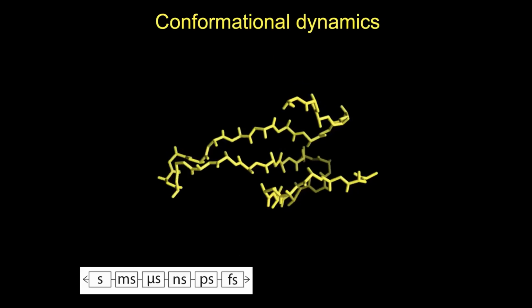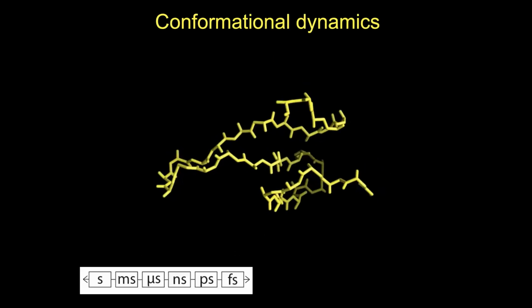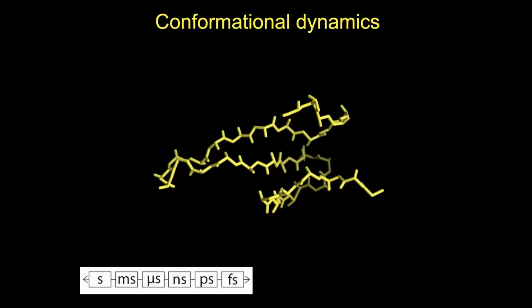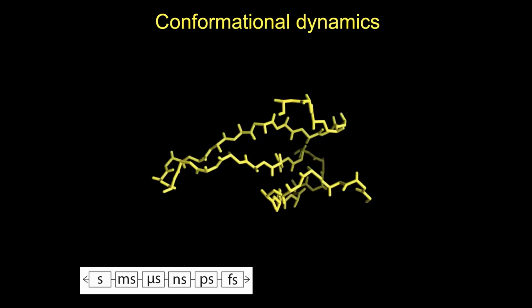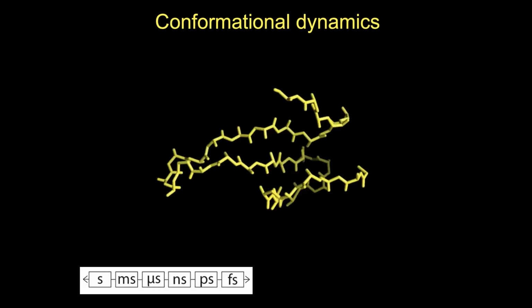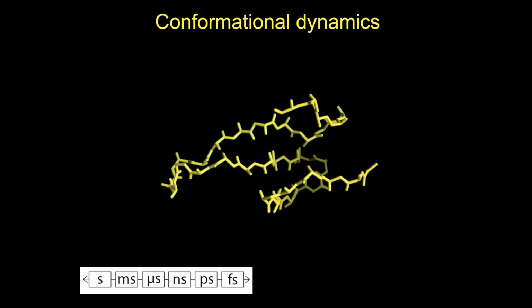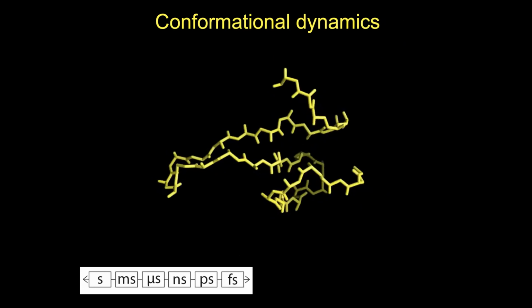So first of all, what is an eNOE? This is short for an exact NOE. As you all know, proteins or also nucleic acids are dynamic, and there are many probes for dynamics out there, and we want to add an additional one, or at least a more sophisticated form of a probe.